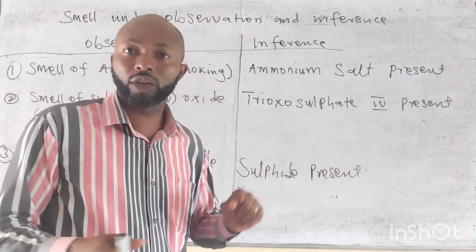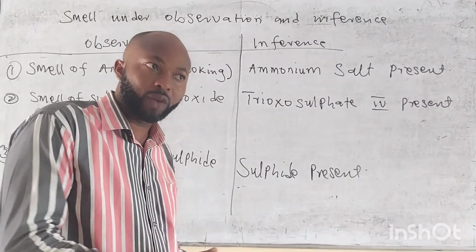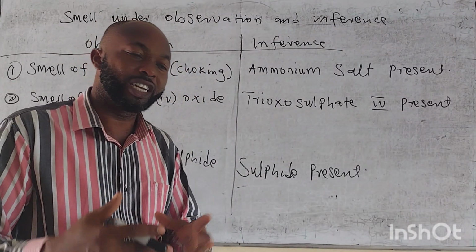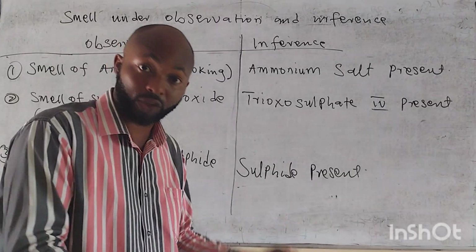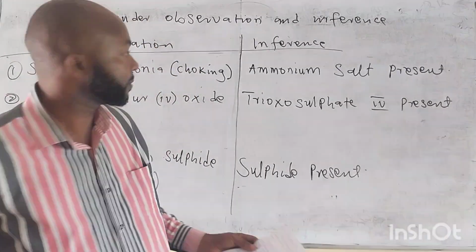Okay, this one that is soluble. If the color is white and we have zinc, which is white, is zinc soluble in water? If it is soluble, you now say, oh okay, zinc, but lead is not, for example. Do you understand? You begin to streamline it down to the exact cation. These are various ways which we use to identify the cations present in solutions or in a salt. All right, so let's go forward to see what happens in solubility.